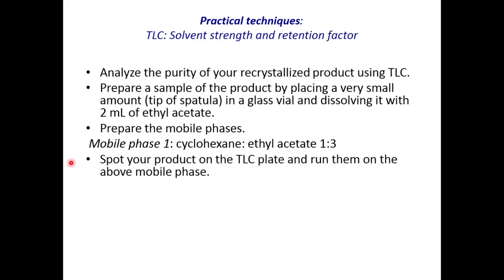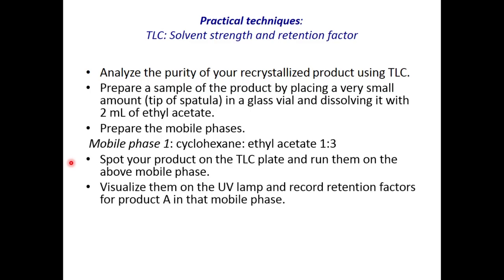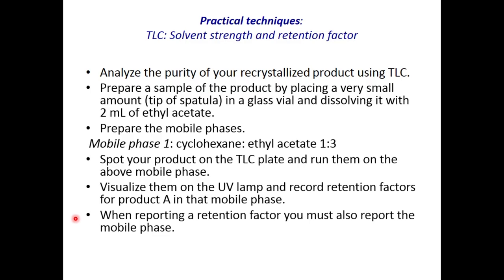We spot our product on the TLC plate and run it in the above mobile phase. We're going to visualize the spots under the UV lamp and record retention factors for product A in that mobile phase. When reporting a retention factor, you must also report the mobile phase.